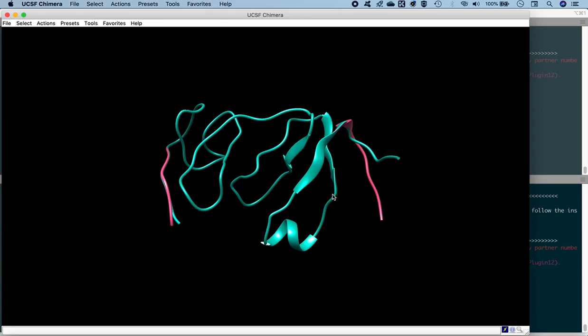So that's great. You have a refined loop region, and we reconstructed the loop region at first, and that's how you generate the missing residues of a PDB file in a short fragment. The missing residues, if you want to reconstruct them by PyMol, necessarily have to be less than 10 residues.